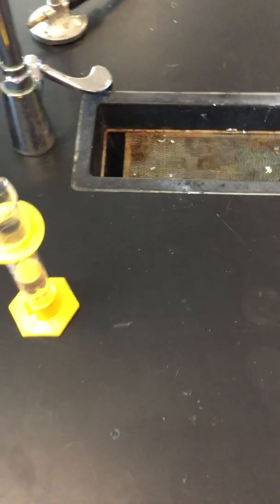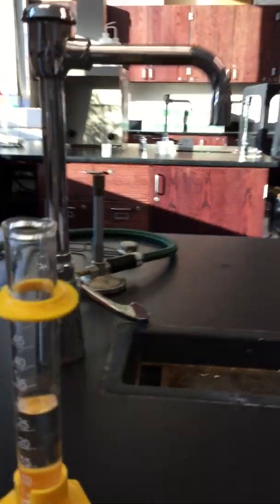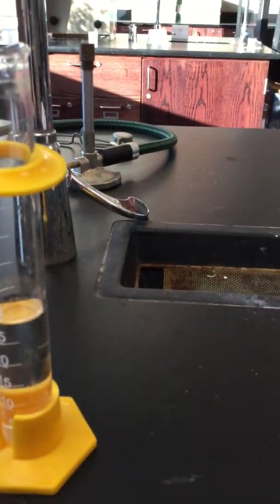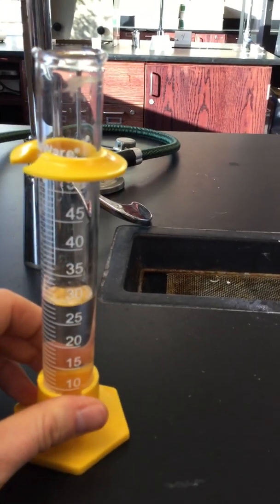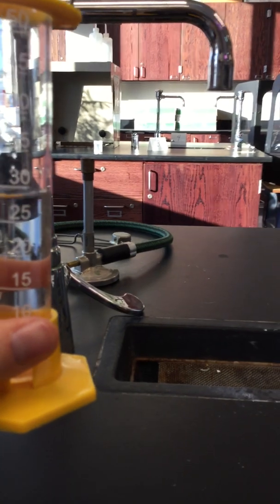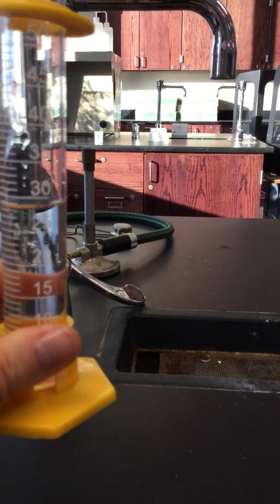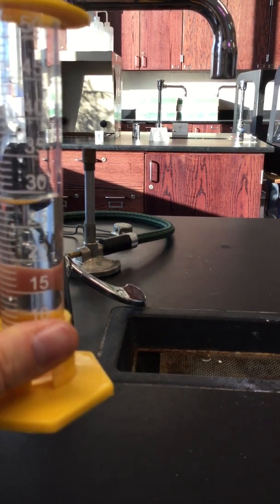So the first thing we're going to do is head to station 1. At station 1, we have a graduated cylinder, and I'm going to move down so you can see the graduated cylinder. Our goal is to record the volume. Let me just hold this up so that you might be able to see that at a better height. See if you can record the volume in that graduated cylinder.